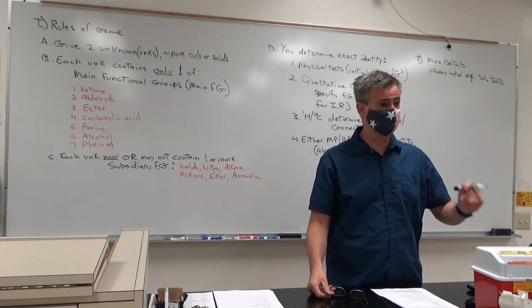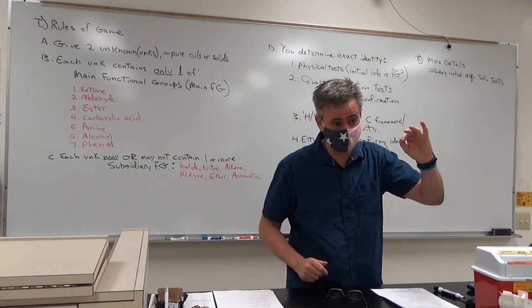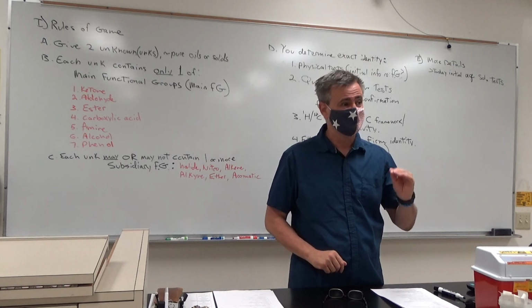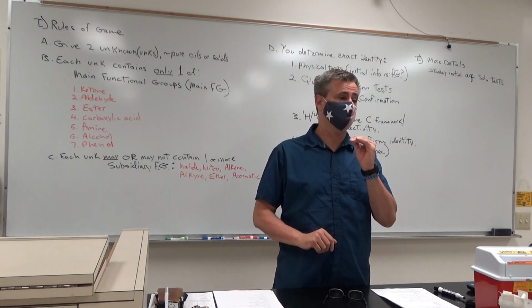Another thing if you're following the flow chart: it's not soluble in HCl, so now I'm trying concentrated sulfuric acid.